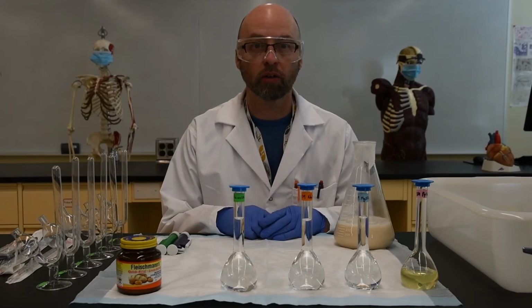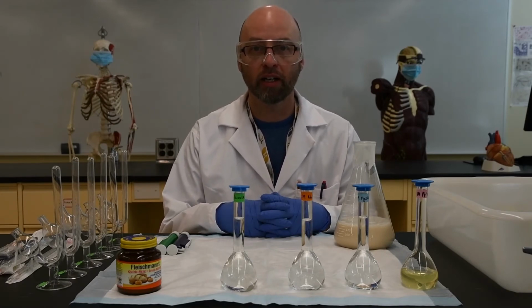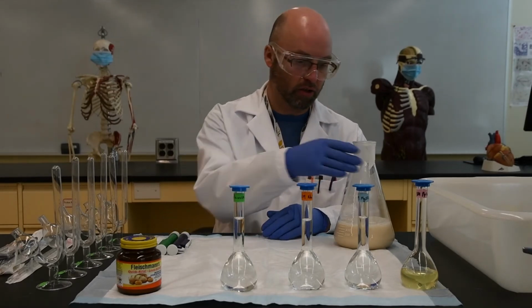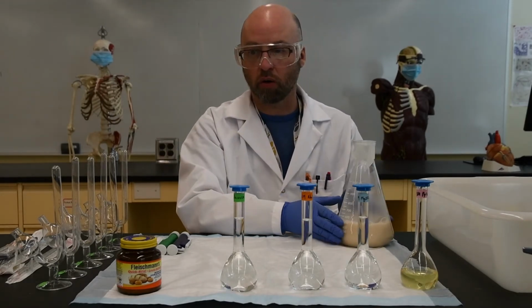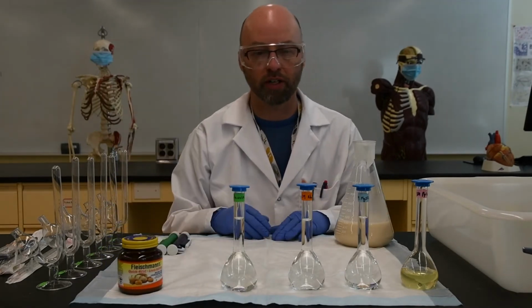Hello and welcome back to the biology lab. This is now lab number 3 and it's the alcoholic fermentation of yeast. So here's our yeast. It's actually in a suspension, a 5% suspension, and basically that's just warm water with store-bought dry active yeast that's used in bread making.